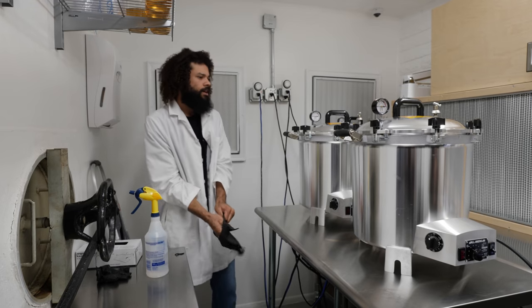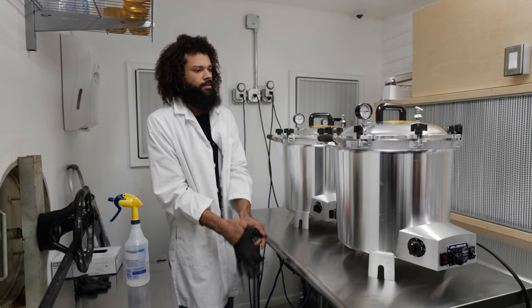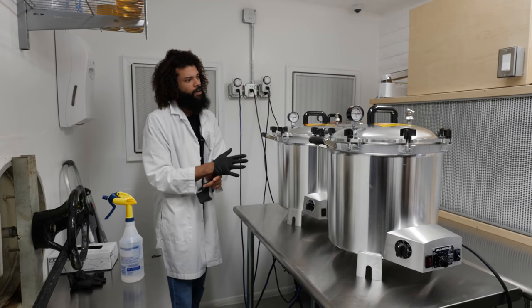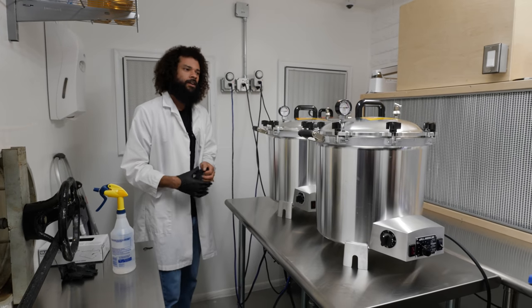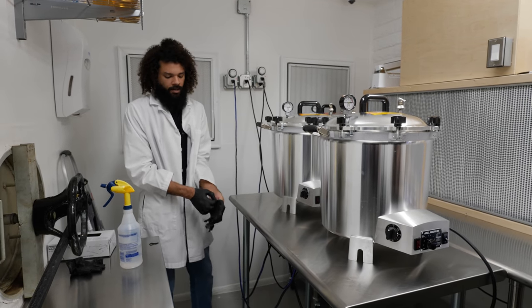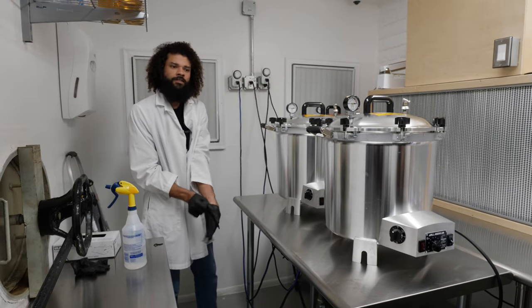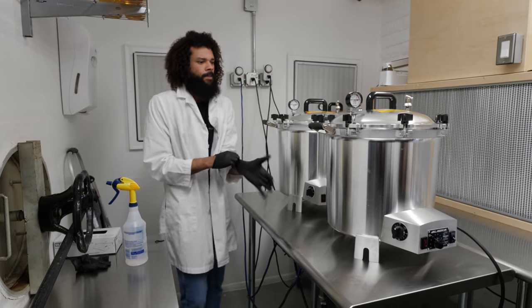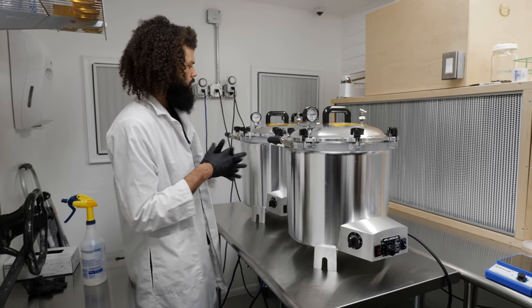So today we've sterilized some liquid media for liquid culture inoculation. It's been able to cool right in front of the sterile airflow of the HEPA filters, and at this point we can unload it and begin conducting the tissue transfers of some freshly colonized agar and grow out our mycelium like that.